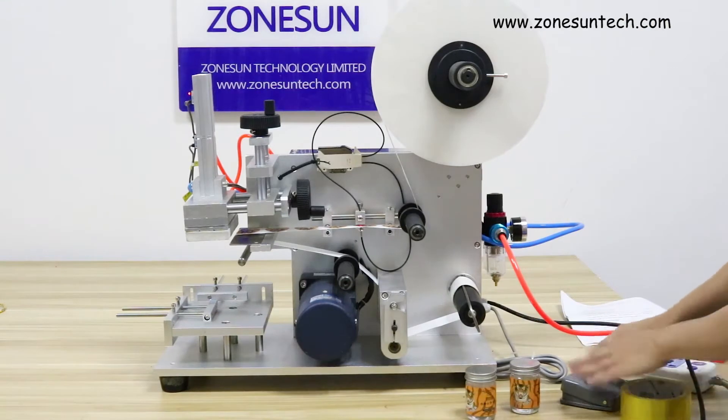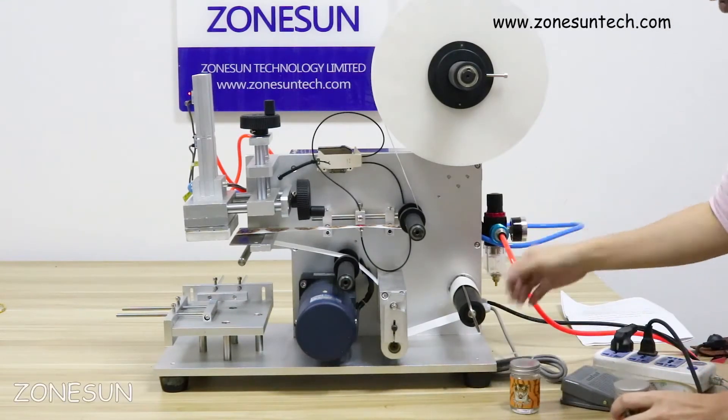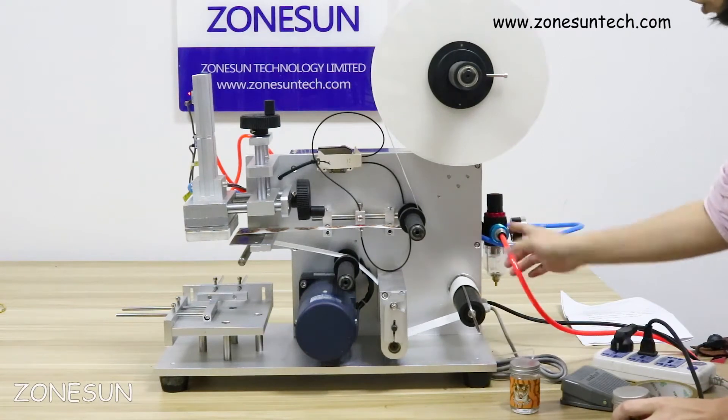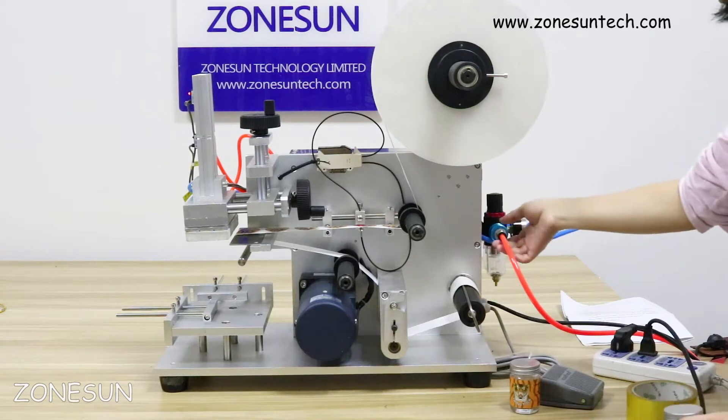Now I would like to show how it works. It's a pneumatic and electric machine. You need to connect it to the air compressor and put on the air.